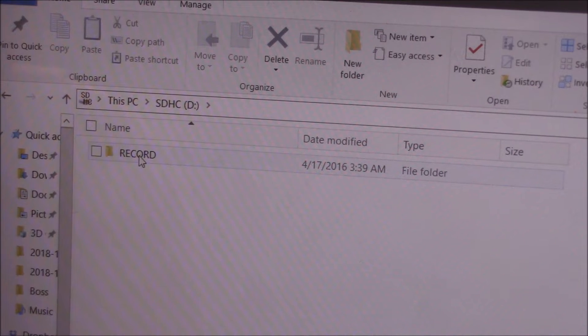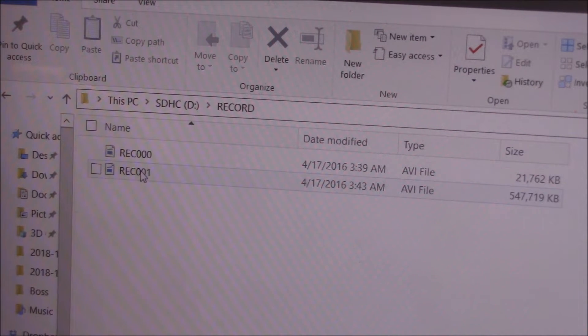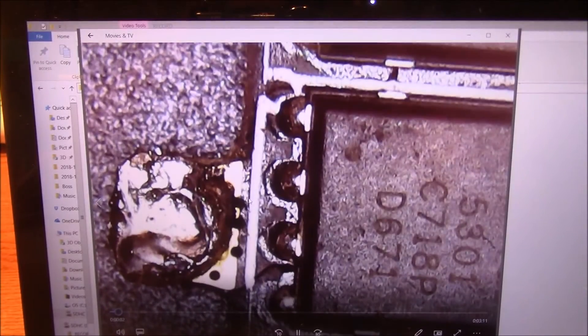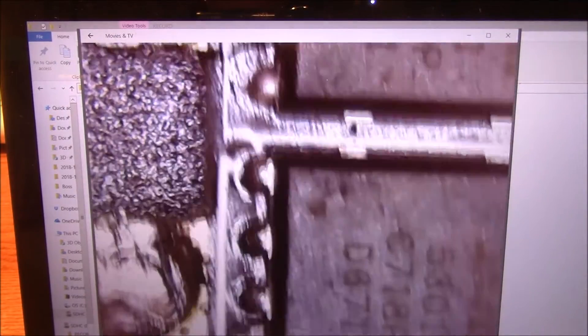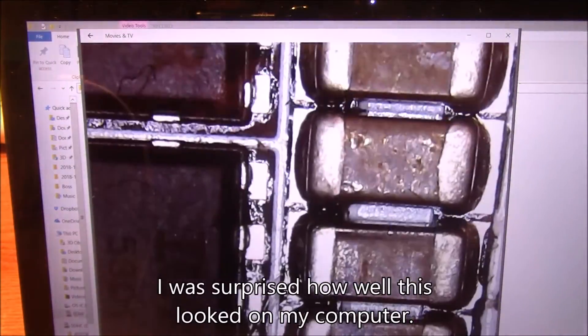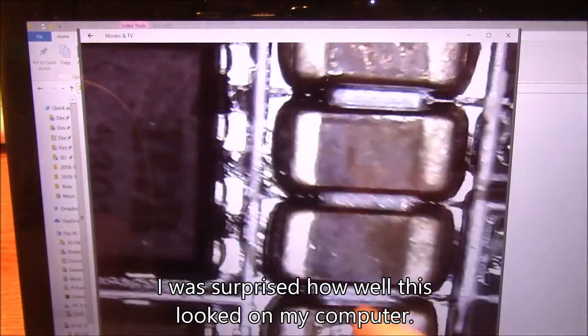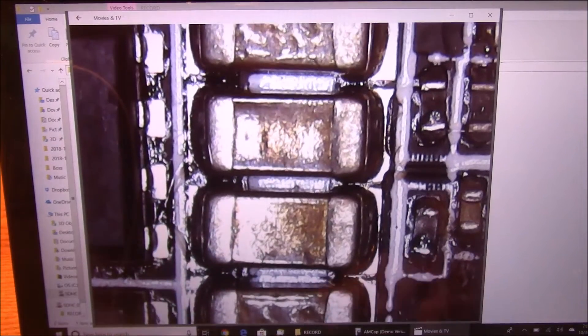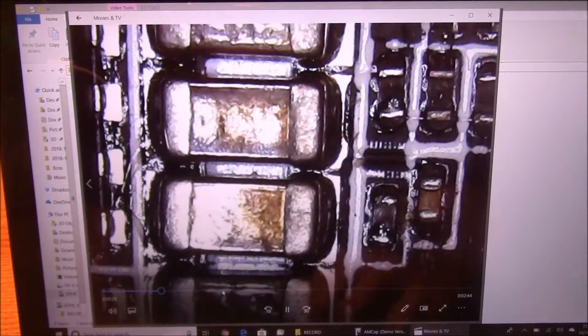Here are the contents of the SD card — it just has a record directory and inside there it has the two files that we recorded a little bit ago. Let's go ahead and open one up and see how this looks. This doesn't have any audio because it doesn't have a microphone on it, but it is moving around just fine. Wow, this actually looks better than it did on the little LCD screen — maybe because it's bigger. It's just a playback file and you can see the scroll bar moving across. You can skip around through here — there's the carbon fiber and there's adjusting it.